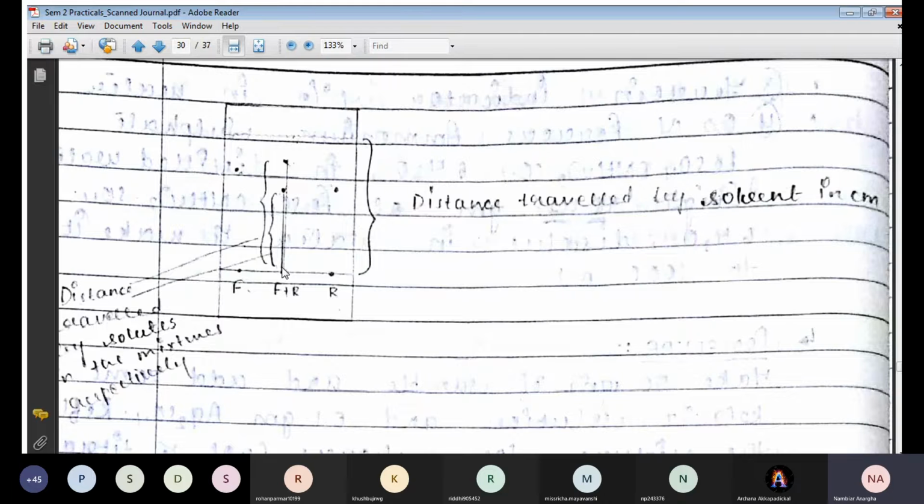This we are doing for the first time. If we see that the concentration is not proper, though here because it is dye, it is okay with one spot. Otherwise, if it is some dyes or amino acids or some other colorless molecule, and we see that the concentration is not enough to have a good run or good separation, we will give another spot in that place. So here, because these are dyes, we do it only once.